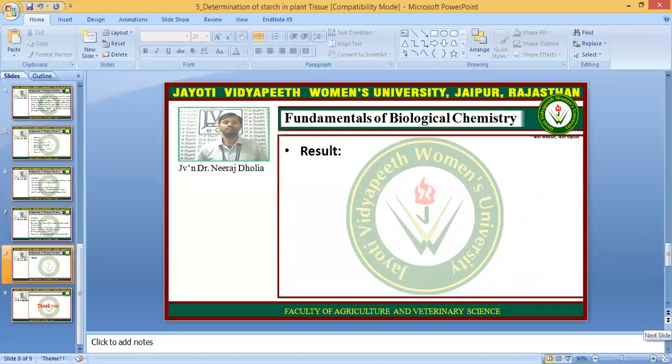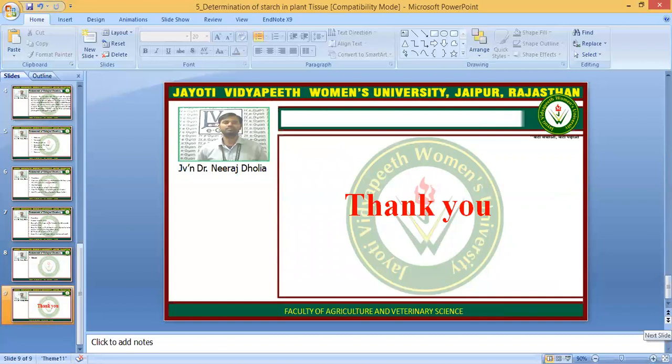The conversion of color to blue-black is the indicator of the presence of starch. Write the results of whatever you observe in the experiment. Thank you. Hope you are satisfied with this tutorial session. If you have any query, please write in the comment box and I will resolve your query. This session is powered by Digital Version 2, Jyoti Vidya Peet.